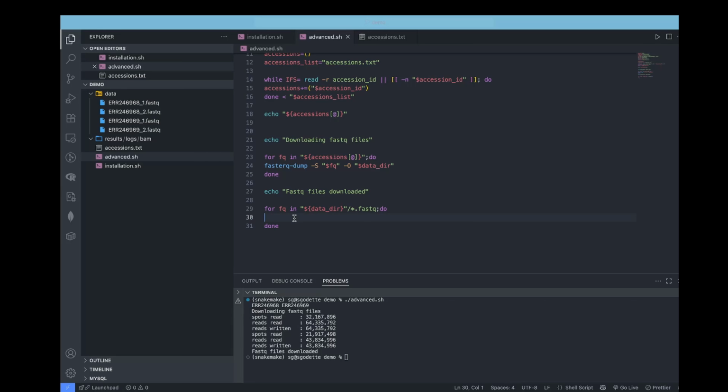So with this simple logic, we will not need to write the entire path of the file. We will just put an asterisk here to read this entire part and just give us the files that end with this name. If there are samples that are named like this but do not end with FastQ, then the program will not return those files to us.